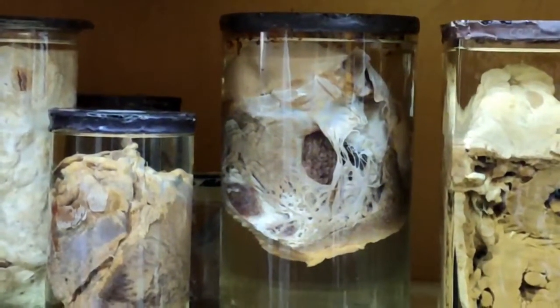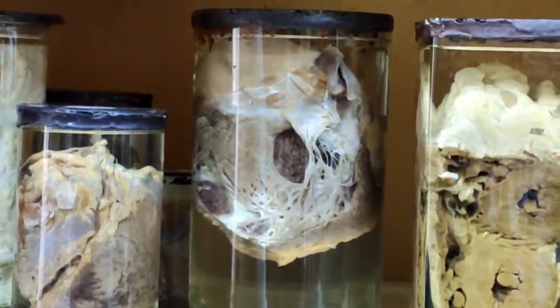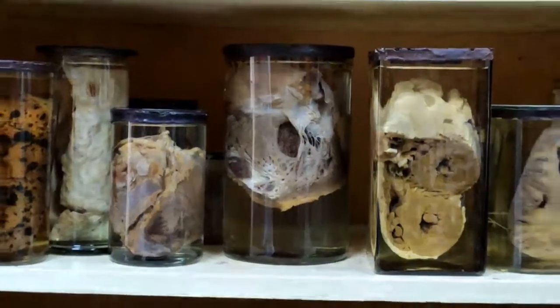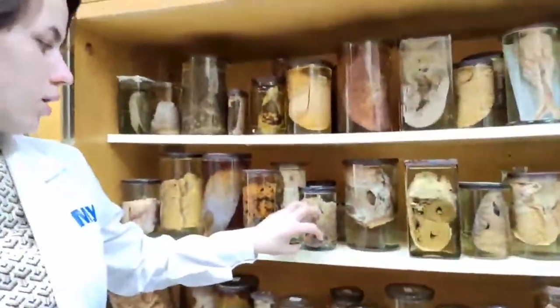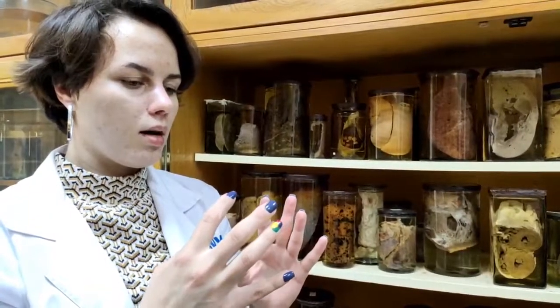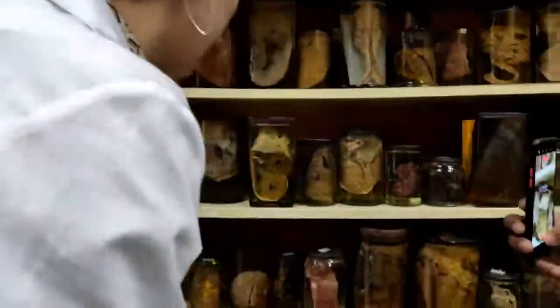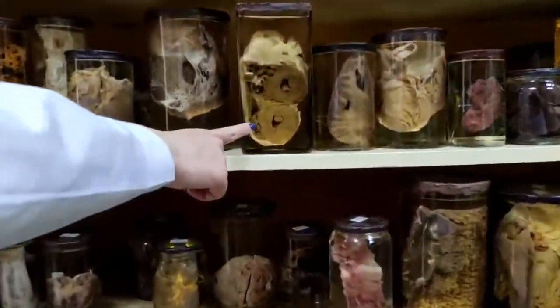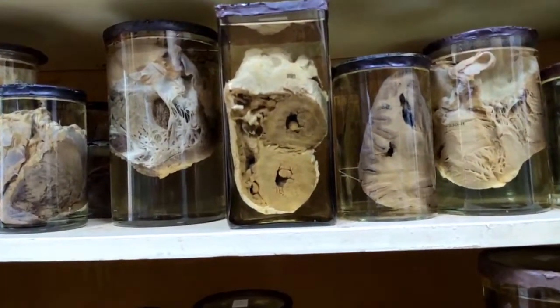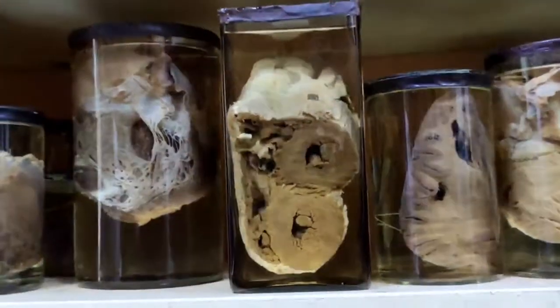Aneurysm of the heart, of the left ventricle, or of the right ventricle can be a complication of the myocardial infarction because in myocardial infarction, some part of myocardium is dead, and that means that this wall becomes really weak somewhere, and aneurysm can develop. The next one is hypertrophy of the myocardium, and this is concentric hypertrophy because there are two types of hypertrophy, concentric and eccentric.